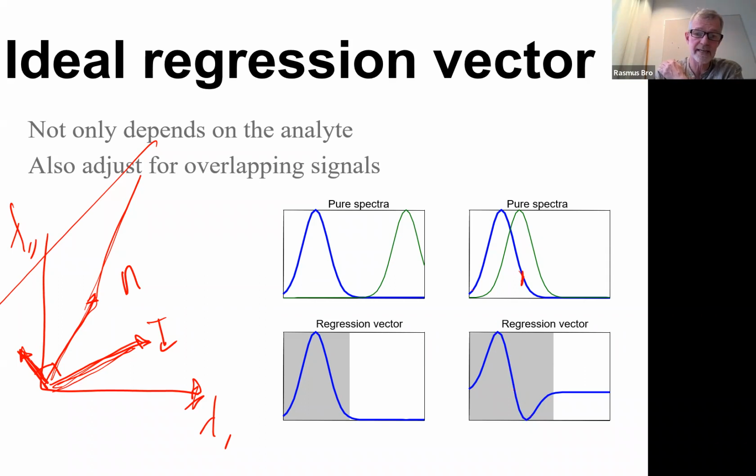So what I could say here is that if in some sense this was related to, let's say, smoking, then maybe we would incorrectly identify smoking as healthy because we didn't see that this particular variable was just correcting for something else. And you have to remember that this is a kind of a stupidly simple example. In reality, life is much more complicated. So the point here is that regression coefficients can be positive, negative, or zero, no matter what the reality is. No matter if there is an effect of the analyte, and no matter what the effect of the analyte is. And that will happen in real data.